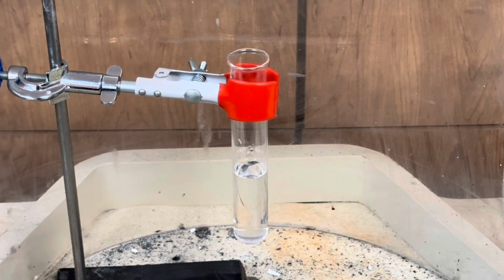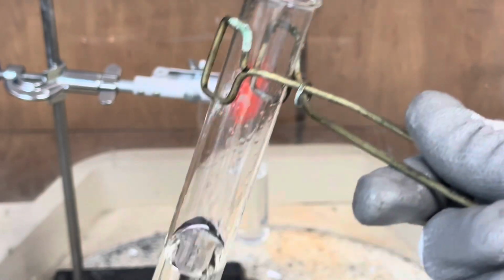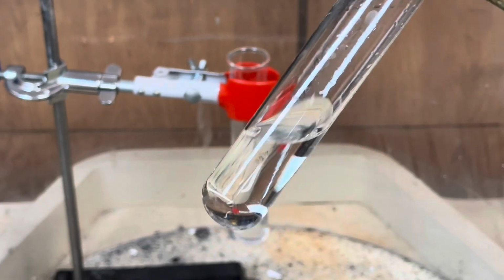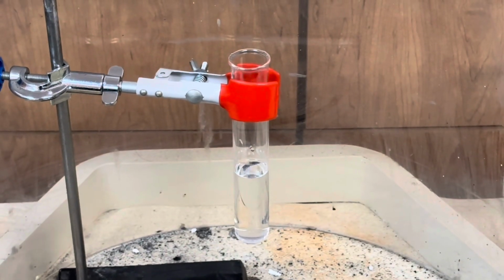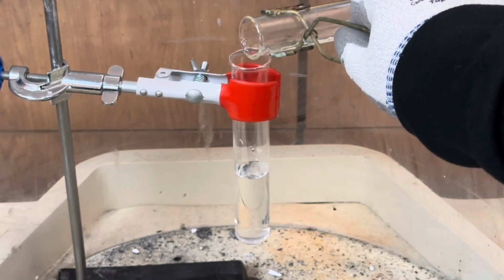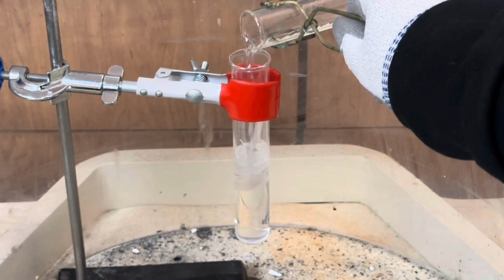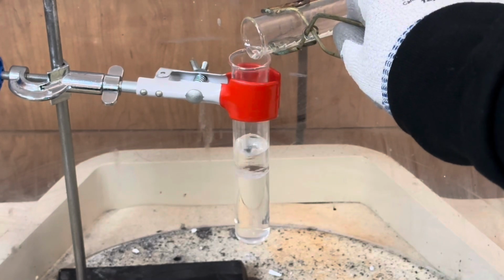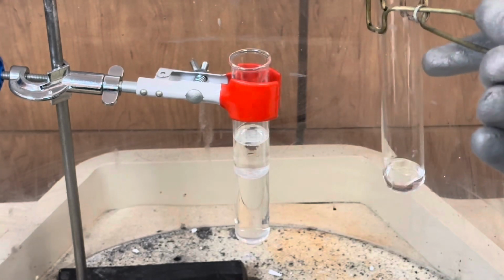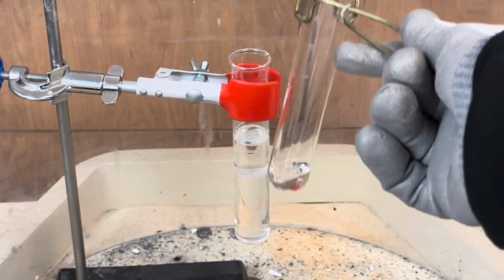Set up your test tube with phenolphthalein and water over a flame blanket behind a blast shield. Make sure that you don't add your wax until it's no longer releasing any kind of smoke and has had a chance to cool. You're just going to add a small layer of molten wax over your water in your test tube. So there's about an inch of suspended wax over the water.